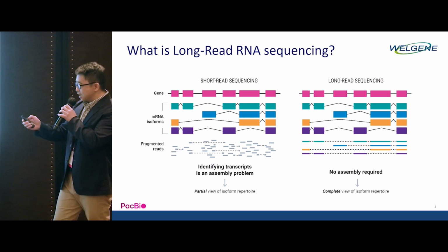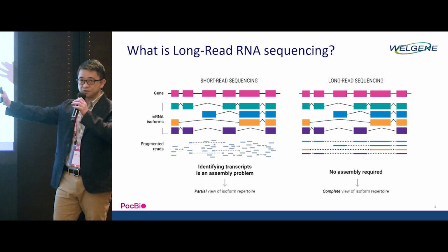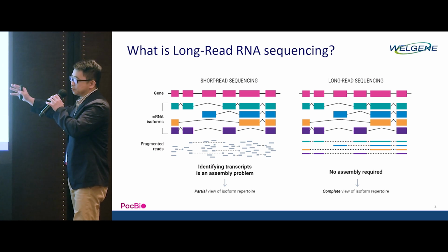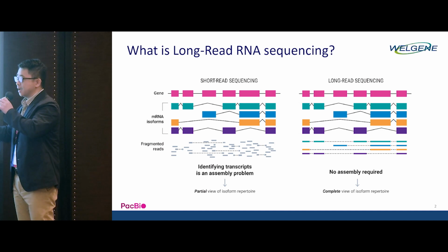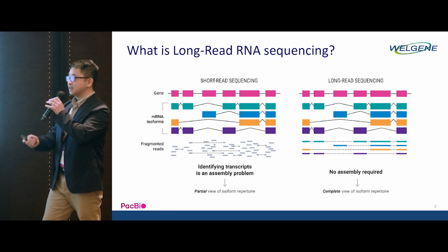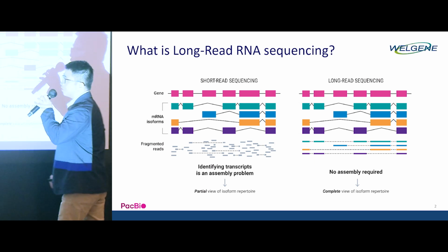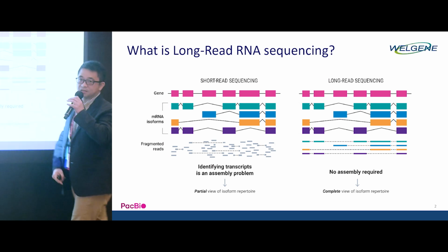As Liz mentioned earlier, each gene has different isoforms. Every isoform comes from different exons. Different exon combinations translate into different proteins and cell functions. As we know, in past years, predominant short reads cannot tell which read belongs to which isoform and which junction.